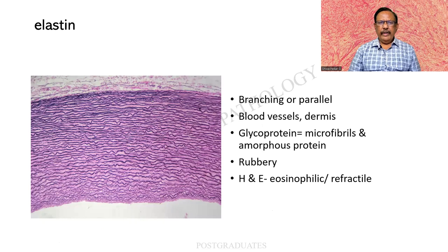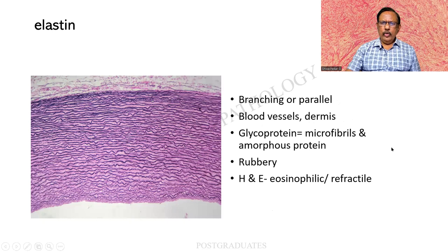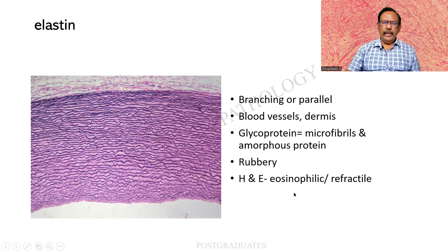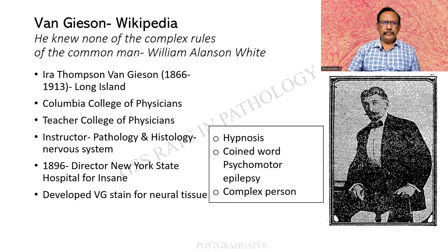This is another friend — the elastin. Beautiful, slender, wavy, parallel or branching. They occur normally in the blood vessels and in the dermis. Glycoprotein equals microfibrils plus amorphous protein. The elastin by itself has a rubbery consistency; that is why it can recoil — that is the property of the elastin. Under routine H&E stains, they are all eosinophilic and refractile; beyond that we will not be able to see them. But here, almost each fibril has been individually brought out beautifully.